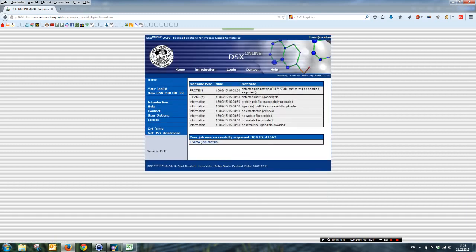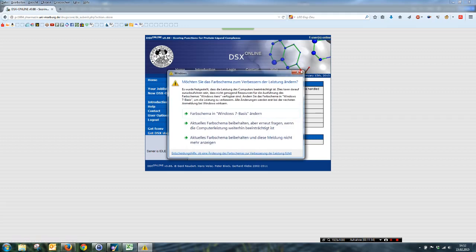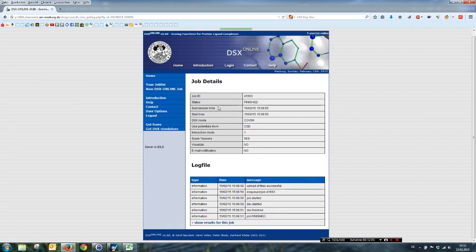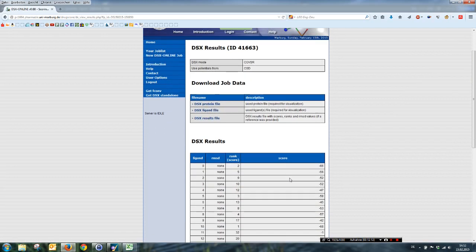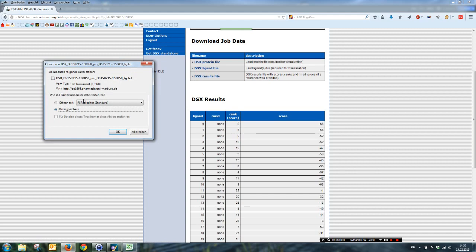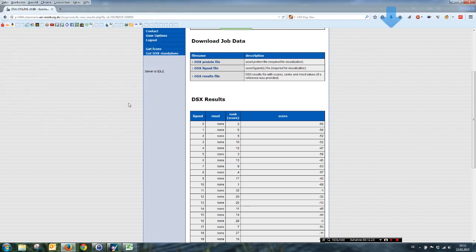Now we have no error. Sometimes when your input database is too big, when you have approximately 1000 poses, then it will get an error here. And you have to use the standalone version that you can download here on this button. And you can use it on any Unix system. I tested it with also a Mac and on Linux Ubuntu, and it works perfectly. Now we view our job status. It is finished. Everything fine. And we want to show the results for this job. So we download the DSX results file and save it to our working directory.